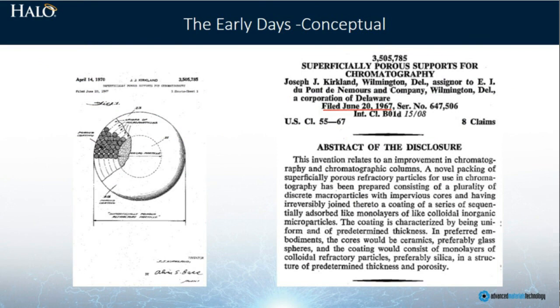This was the conceptual development of Jack Kirkland, and on the left-hand side of this slide, you can see the cartoon depiction of a superficially porous particle with an internal solid core of impermeant silica, a spherical body surrounded by a communicating, freely diffusible exterior shell of microparticulate silica sol.